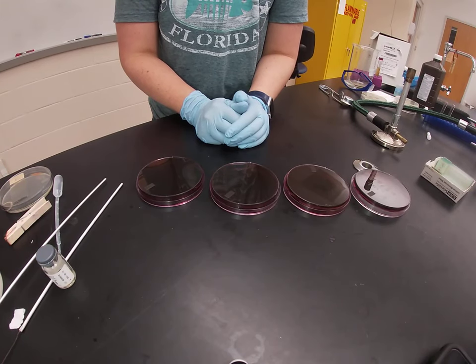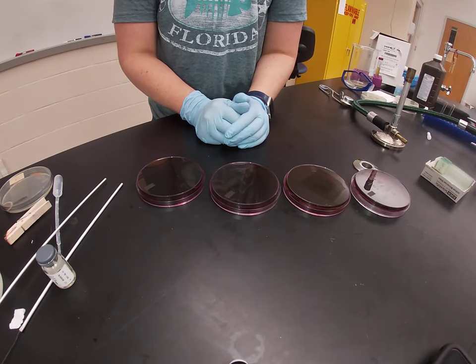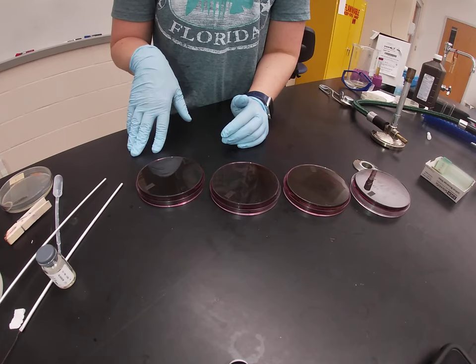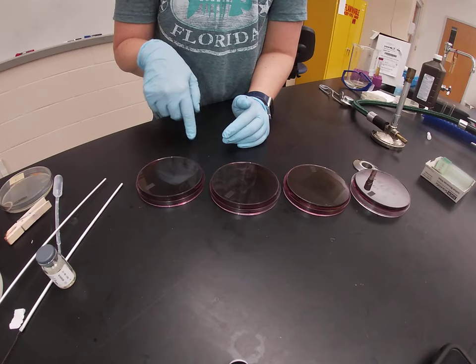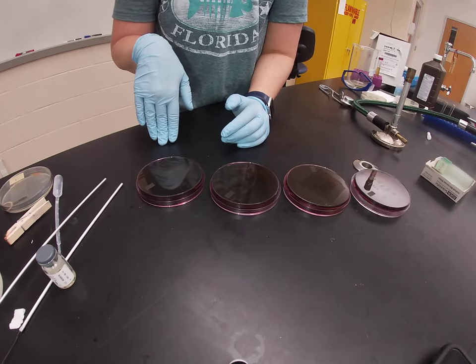In this video, we are going to talk about eosin-methylene blue agar. This is an agar that is both selective and differential. It's selective for gram negative bacteria and it's differential based on the rate of lactose fermentation.